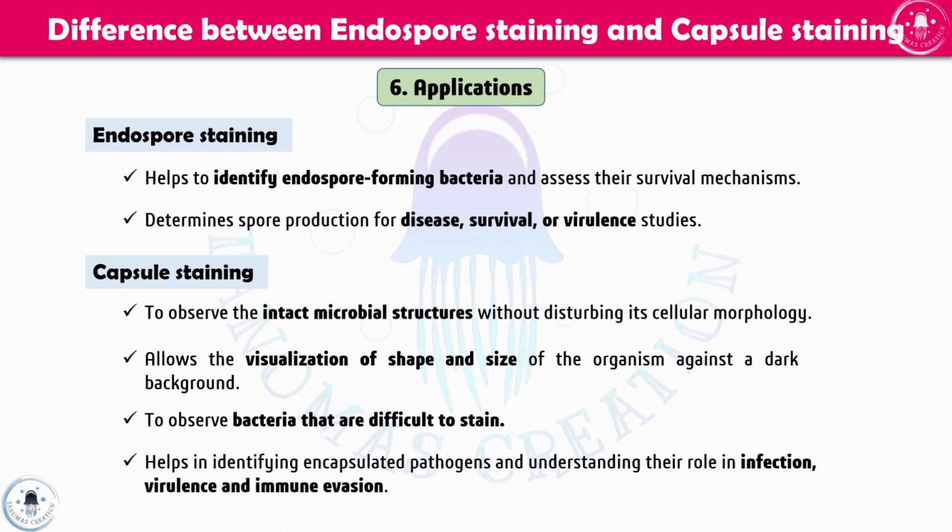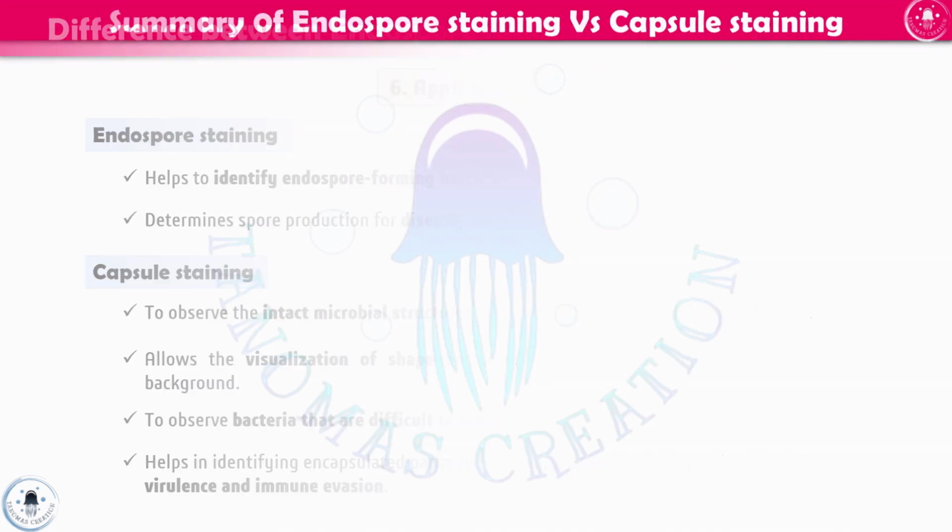This staining also helps in identifying encapsulated pathogens and understanding their role in infection, virulence, and immune evasion. Most capsule-forming bacteria are pathogenic in nature, and this staining method helps to identify these encapsulated pathogens.